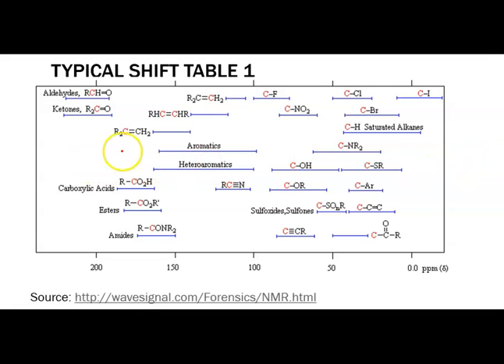If we go way to the left, we talk about carbons that have a very weakened magnetic field, like carboxylic acids. Those carbons are losing their electron density to a double bonded oxygen. Okay, so what we could say is that those carbons with really weak magnetic fields would have to be far away from this magnetic field we might imagine here on the right. Okay, so it's just a way of remembering. But let's look at these shift tables.